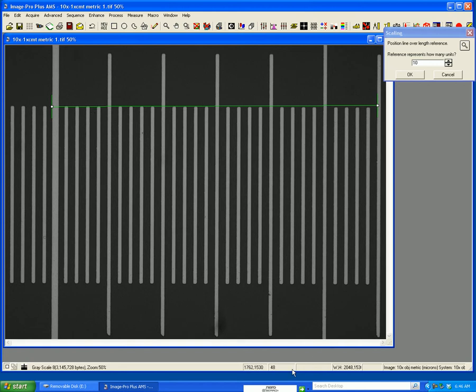If you'll notice down here, this shows you the grayscale. This is a grayscale image, 8-bit, which is how you should capture these. If I go to the black, it's towards 0. If I go to the white, it's going to be towards 255. So my goal is to position this on the edge. Note the value down here was 74, and to try to match this as best I can up on the other side. Then I have to count.